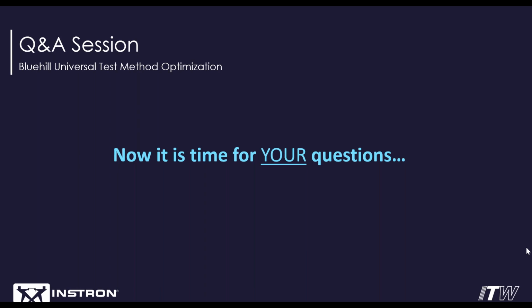So one of the first questions we're going to look at is, can you edit the choice inputs after you've started testing in Universal? And this is something you could not do in Bluehill 3. And in Universal, that is still the case. There are certain parameters that you have the ability to edit once you've started testing, but choice inputs are not one of them, as they could potentially change the actual functionality of the test.